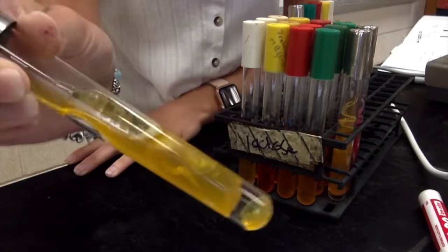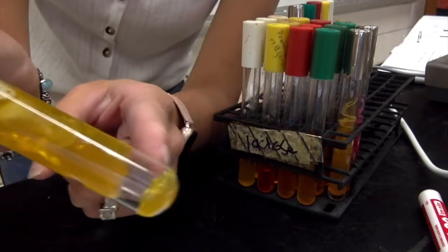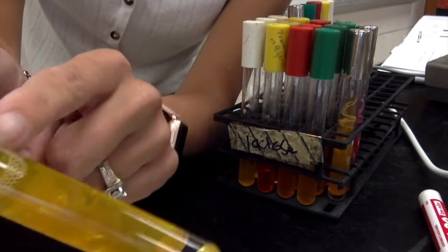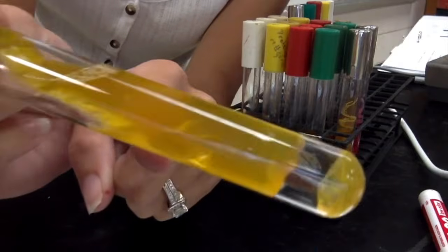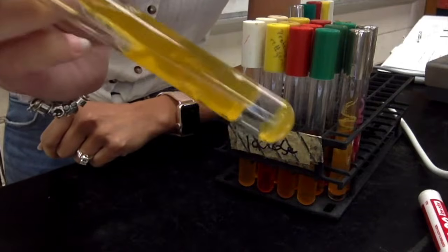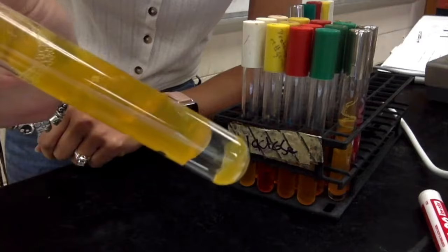Now, you will see that there are huge cracks. This is awesome. Huge pockets of air in there. They have CO2. Look at that huge pocket right there. Look at all those cracks in that media. Okay? So E. coli produces gas when it ferments. This is a huge positive result. I'm so glad that we had great results for that.